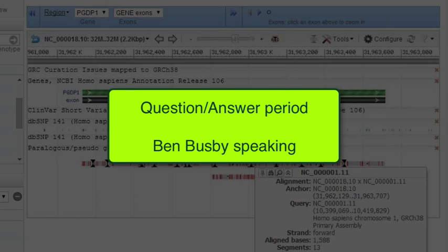Another question that was asked, and I think this might be a broad question, is there a template for making your VCF file? As we all know, many of these file types can vary quite a bit. I typically like to use the definition that's on the 1000 Genomes homepage. I think just for VCF files, that has more or less become the industry standard right now. If you want to discuss that offline, please type something into the question module.